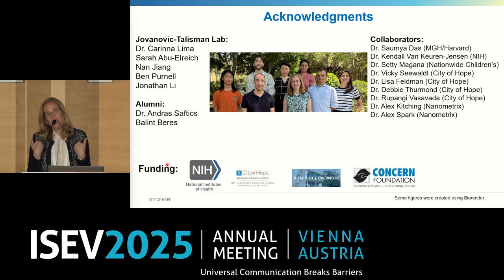So for me, I find things quite reproducible with super resolution measurements, but again, there are other challenges that come with that technique. So what is your favorite machine or technique to count? Oh, for me, absolutely super resolution, but again, it's colored by my experiences, and I often have things that are heterogeneous. But if I have to do something fast, then it's the other answer. If I have a subpopulation, it's the other answer.